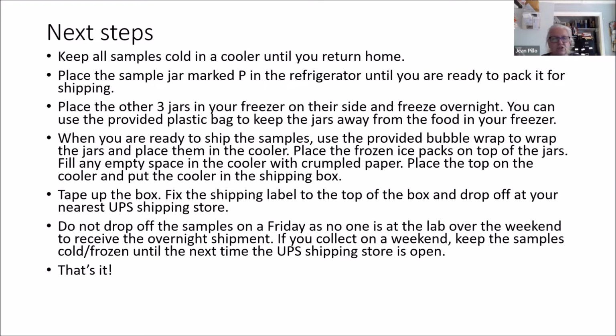The other 3 jars you're going to put in your freezer on their side, and you're going to freeze them at least overnight. There's the plastic bag that everything came in. You can put the jars in that bag if you want to keep it separate from your food, and then take it out when it's time to ship, but they have to be frozen solid.